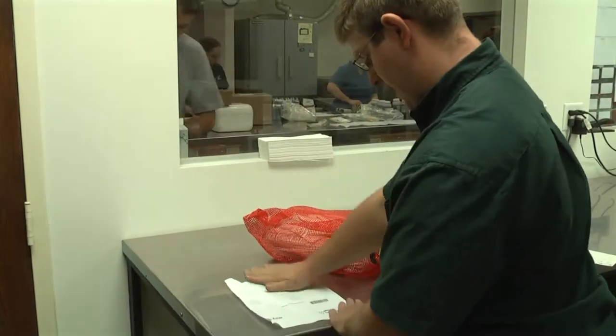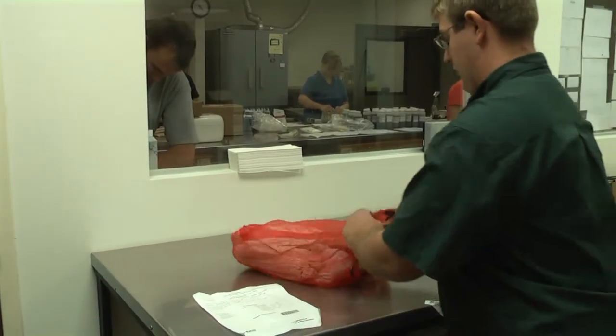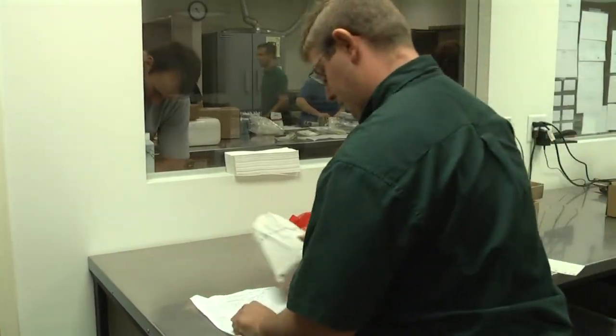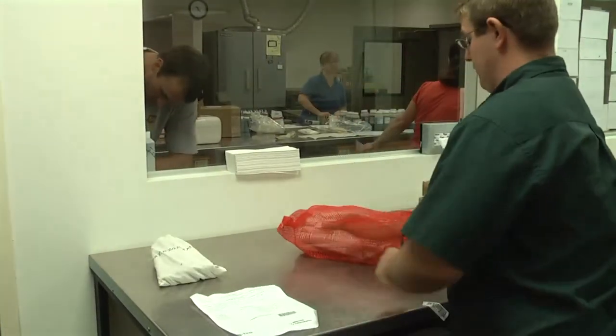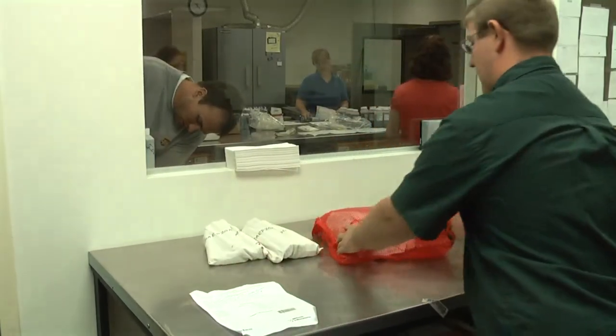This is the pre-made paperwork with our Midwest Labs auto-submit number on the paperwork. It appears that there are one through four samples on this particular field ID, and what we're going to do is lay them out one through four.